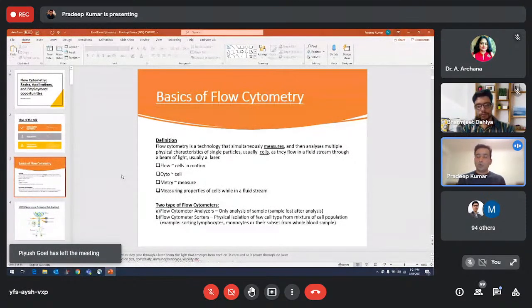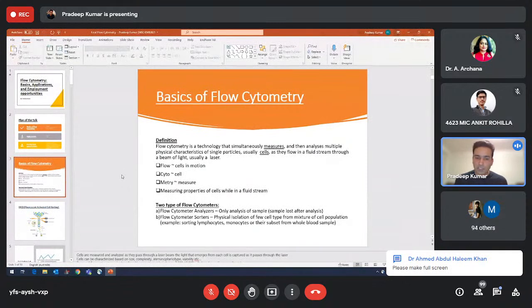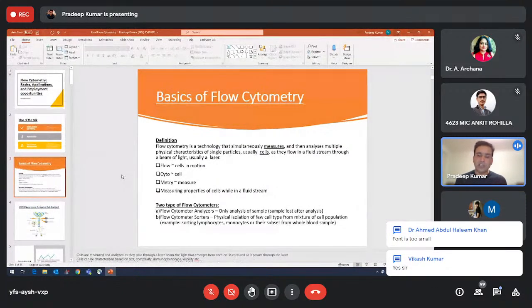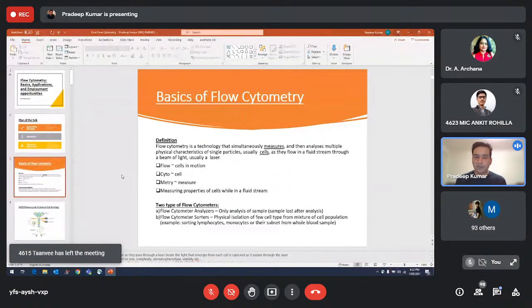Okay. Generally, there are two types of flow cytometers. One is called flow cytometer analyzers, and the other is called flow cytometer sorters. The difference between these two instruments is that analyzers analyze your cells and give you some information. You get the statistics and then analyze your data, and all the sample that you're running through the flow cytometer goes into waste. Sorters analyze your populations the way analyzers do, but at the same time you can physically isolate 4 to 6 small subpopulations into separate containers like Eppendorf tubes, PCR tubes or 96 well plates, different platforms. So with sorters, you have physical isolation of cell types. With an analyzer, it's just the analysis. So sorters do both things.